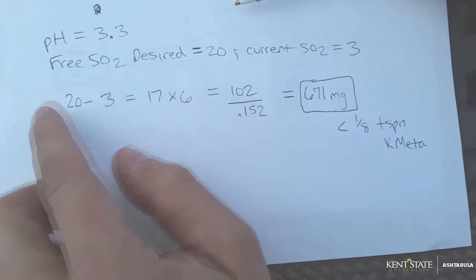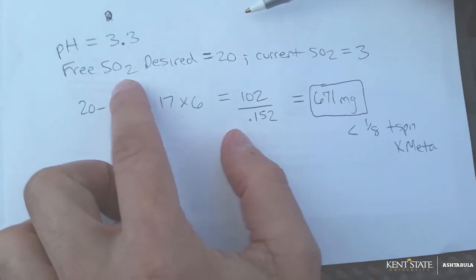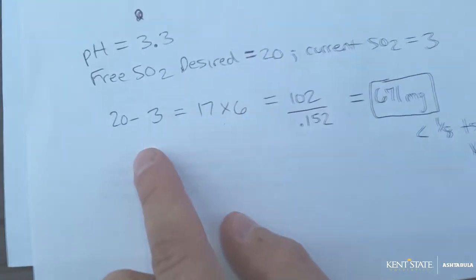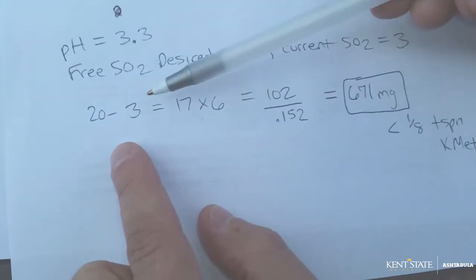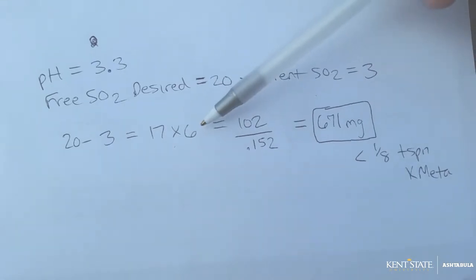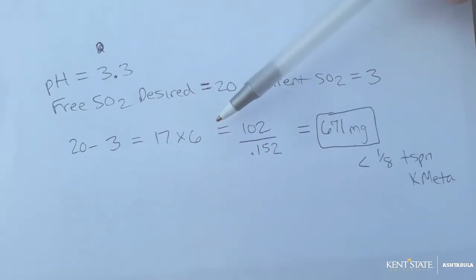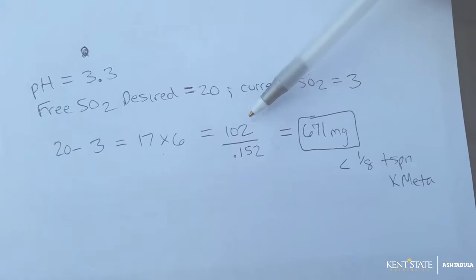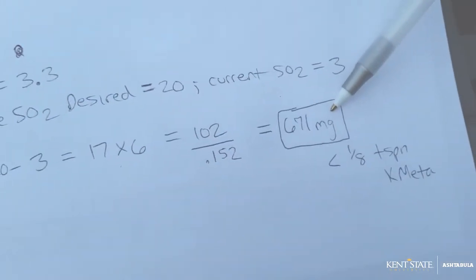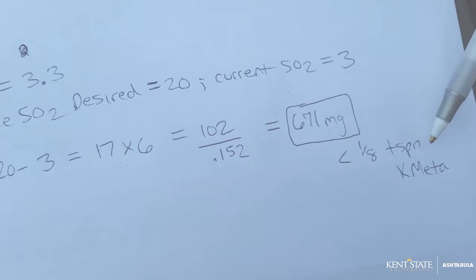And let's say I'm desiring a free SO2 level of about 20, and my current level is at about a 3. Using the formula that they have up here, 20 minus the 3 gives you 17 times 6 gallons, which is what I have currently in the carboy. Gives me 102. I divide that by the 0.152 here, and that ends up giving me an estimate of about 671 milligrams of K-meta to add, or just a little less than 1/8 of a teaspoon.